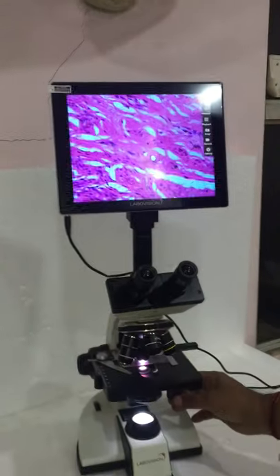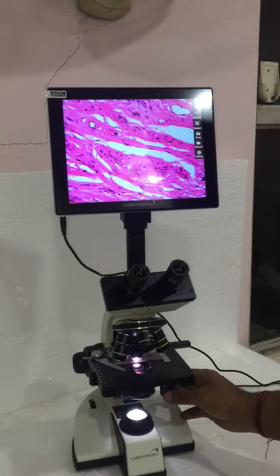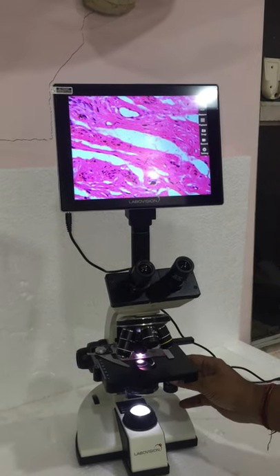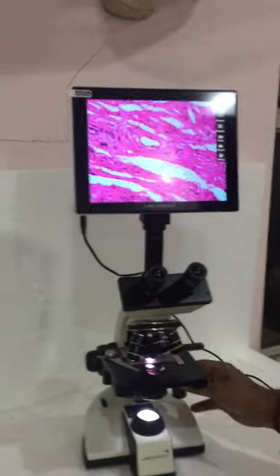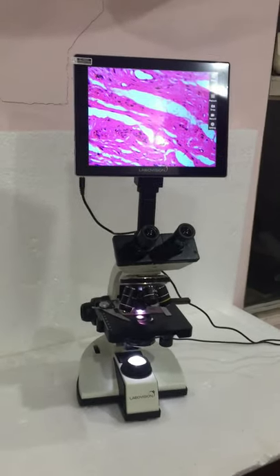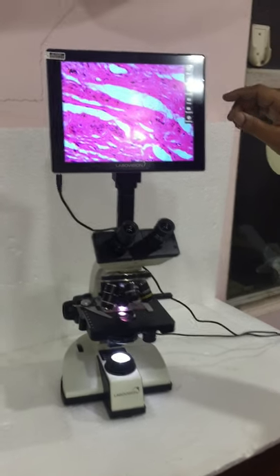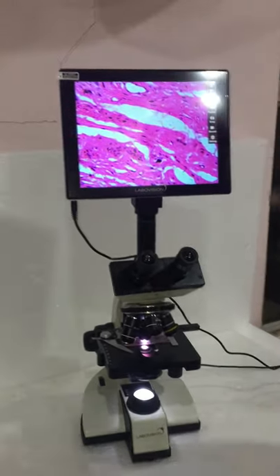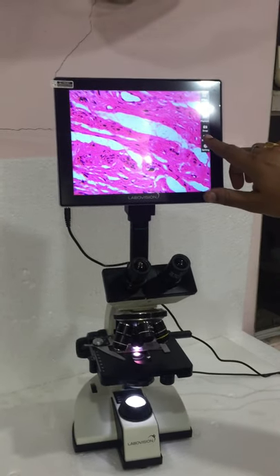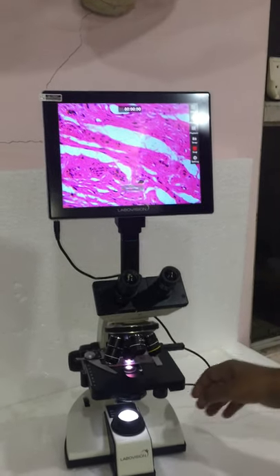This is at 40X magnification. Moving the lenses, we will capture a snapshot first. The image has been saved in your folder, and you can also have a video recorded along with a voice narration.